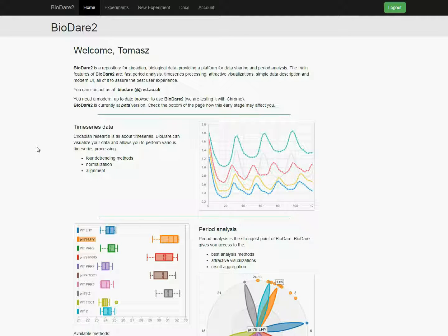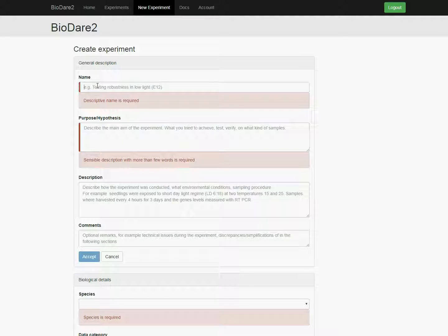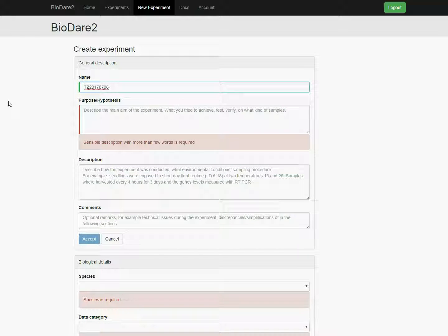In this video I'm going to show you how to enter data into BioDare. I start by creating a new experiment. First, I have to name it. Please be more verbose than some lab book code. For example, I include the genotype and conditions in the experiment name.